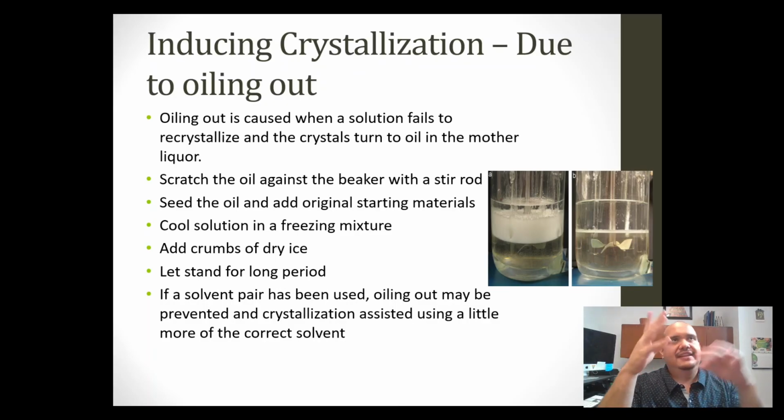The crystals can then see these little glass seeds surrounding in the solvent, and they start to trap, and they start to grow and seed their scaffold around this glass. And that is what's called seeding, and that is how you would troubleshoot if you should experience oiling out during your recrystallization. You seed the oil in the original mixture, and that will start to cool, and the crystal will start to grow a scaffold around that glass.